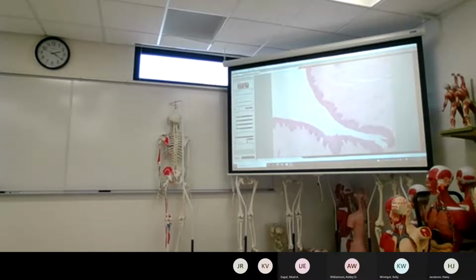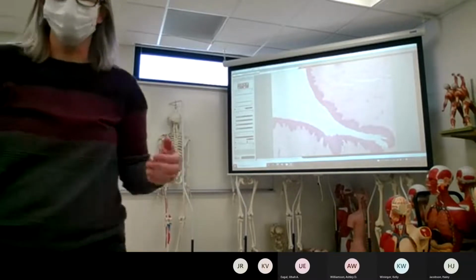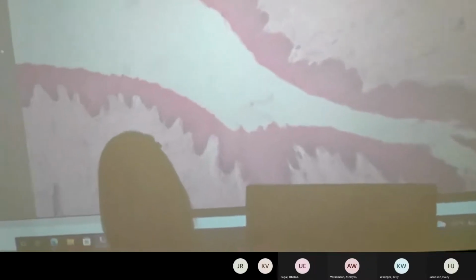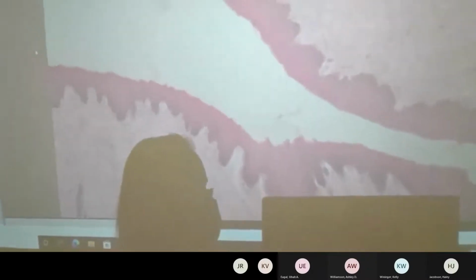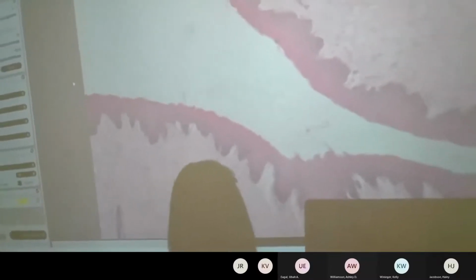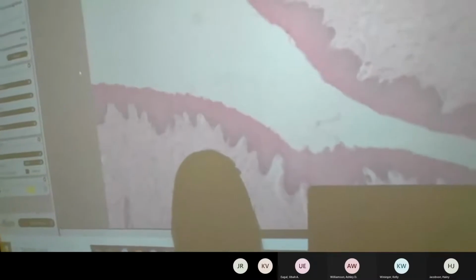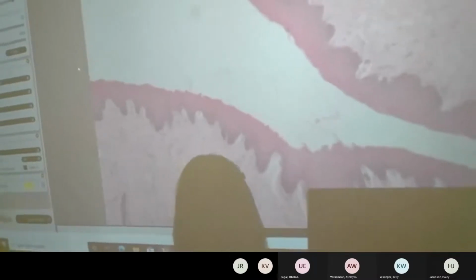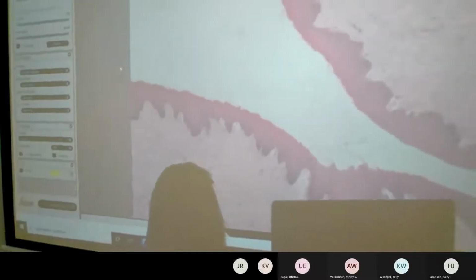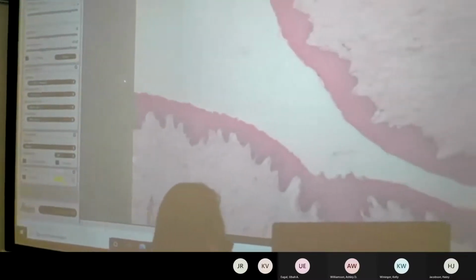And so usually we grab skin to do stratified squamous epithelium. Again, we want to try to find a margin where it looks like there's some type of opening. And then what you see in that opening is a pretty dense few layers of cells. There are no blood vessels in there, no breaks or tears in them, and they're forming a pretty good barrier.